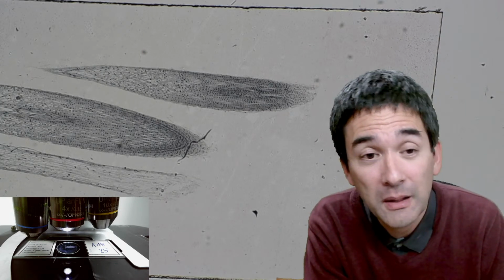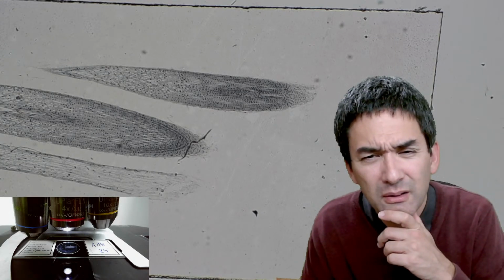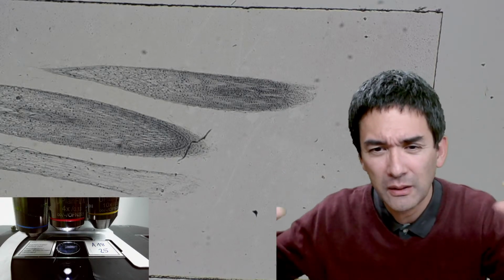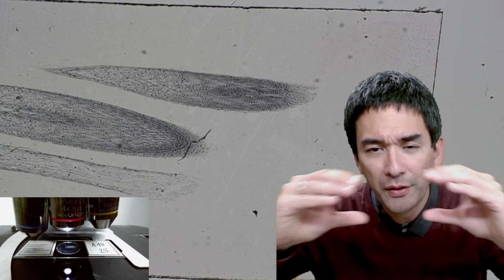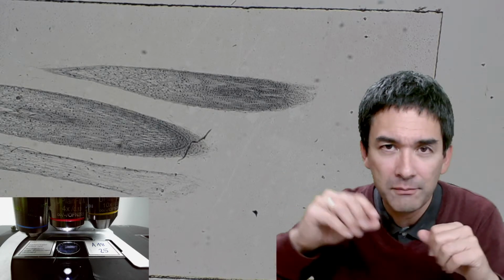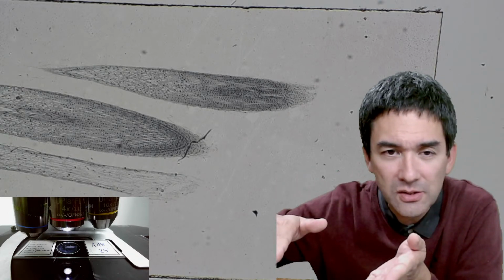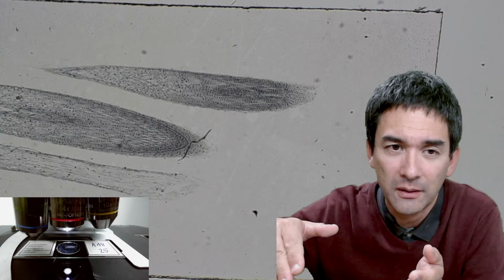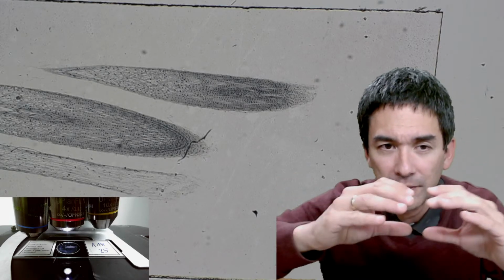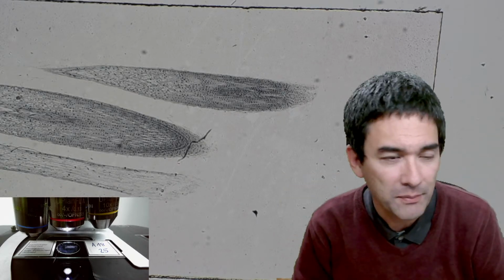and so that is the reason why onion roots. And the second question that you might want to ask is, let's look at the top one. It looks a little bit like it's tapered off on both ends. Why is that? Well, because if you make a thin section, then the section was cut diagonally. If you cut it diagonally, then the two-dimensional section will appear to be tapered off. Okay, that's the only reason.